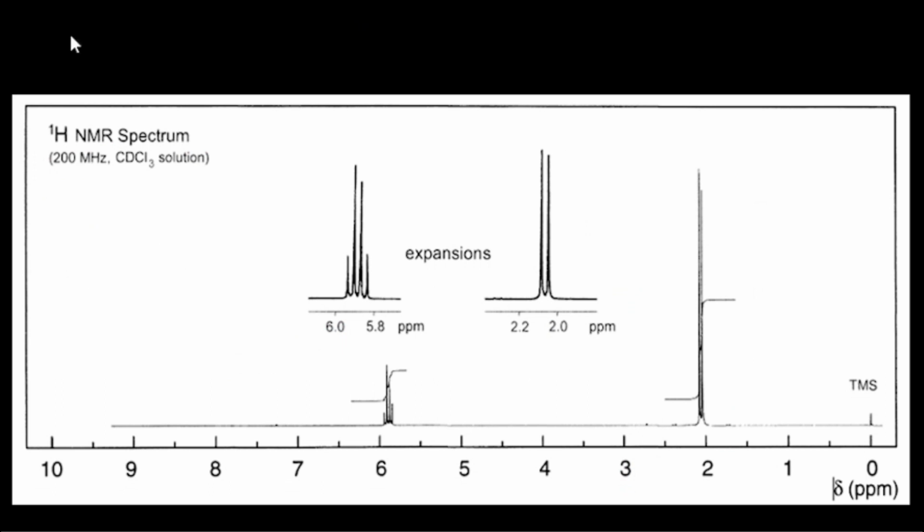So here, this is the proton NMR spectrum of this compound. Here, one peak is here and the other peak is here. Two peaks are present here.